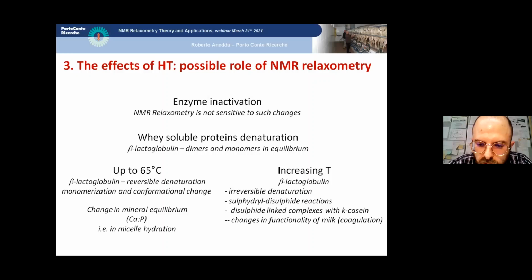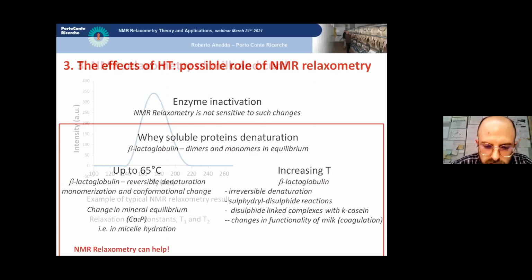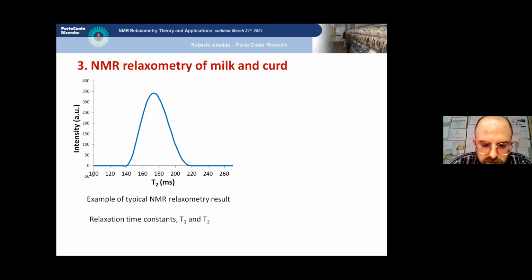it's quite tough. NMR is very useful in describing molecular mobility and system dynamics in general, so it can be used in these cases. Many denaturation steps can be followed by NMR relaxometry. Now, NMR relaxation phenomena describe dynamical interaction between the molecules constituting a given system.